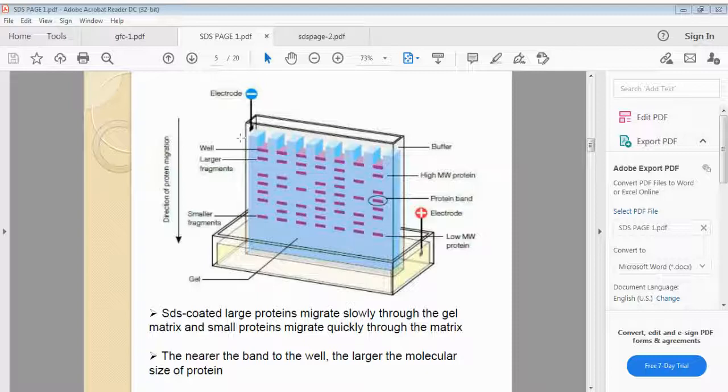In our laboratory, students would add all these different ingredients, SDS, bromophenol blue, beta mercaptoethanol, glycerol, weighed separately, to make the buffer. But nowadays ready-made sample loading buffer or sample digesting buffer is available, called the Laemmli buffer.